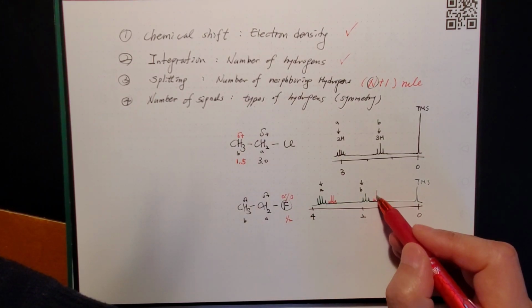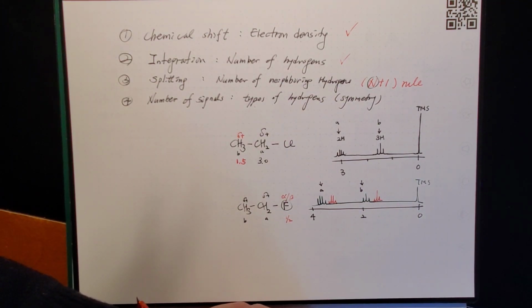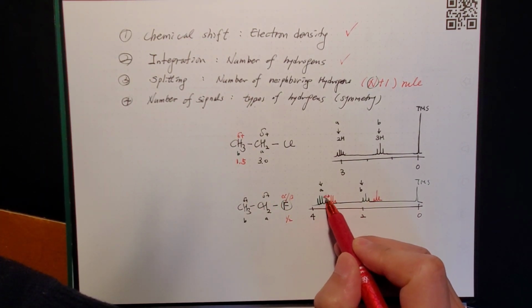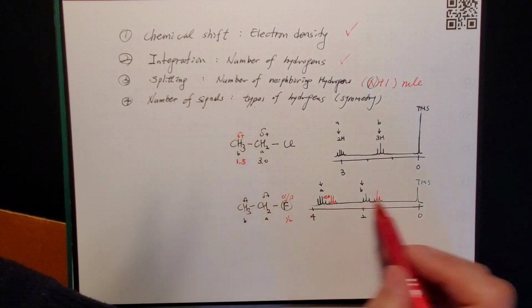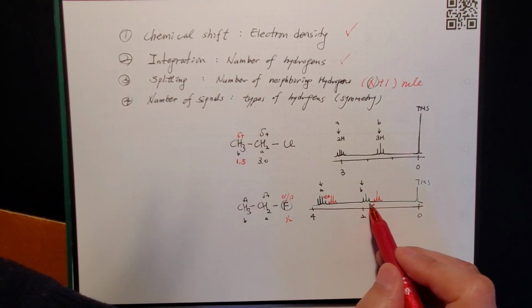And here you get another triplet, also made by the fluorine. Then this is close to the fluorine, so they are more apart, okay? And this is far away, so the influence is small, so the numbers are more similar, so they are closer.